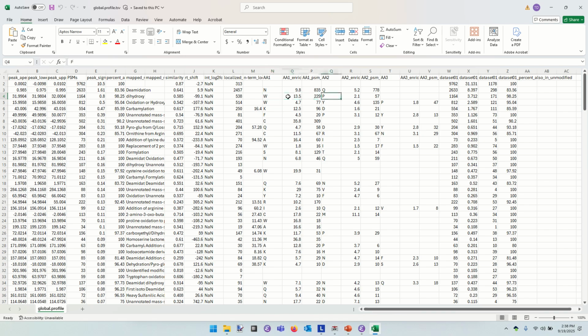Likewise, we have proline over here. Proline is kind of a squirrely amino acid when you get down to it. It can always get up to something. And dihydroxy modifications are one of the possible ways. One of the things you should know is that your cells use a lot of this ECM, extracellular matrix, to kind of glue themselves to their neighbors and to communicate with each other. And that stuff is a large amount of collagen protein. Collagen has a huge amount of modified proline. So I mentioned the weird case of proline having one oxidation looking a lot like leucine. Similarly, we can see double hydroxy modifications here.